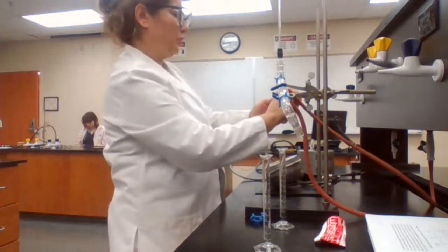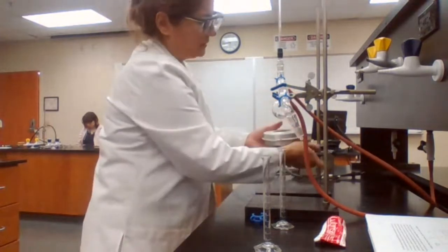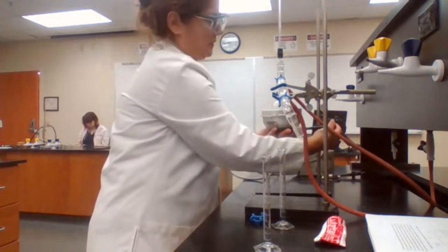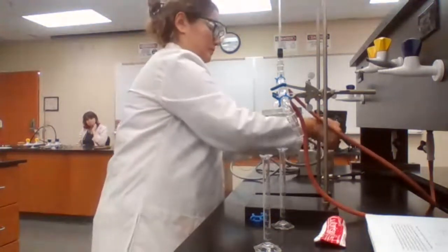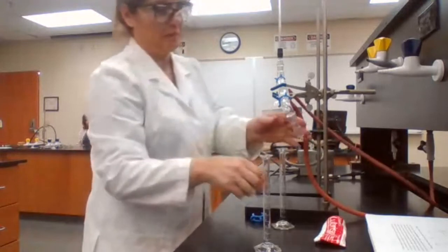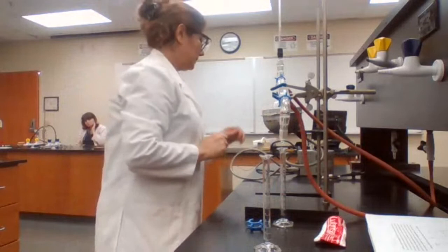I reconnect the boiling flask and bring the heating mantle back up. And start the experiment.